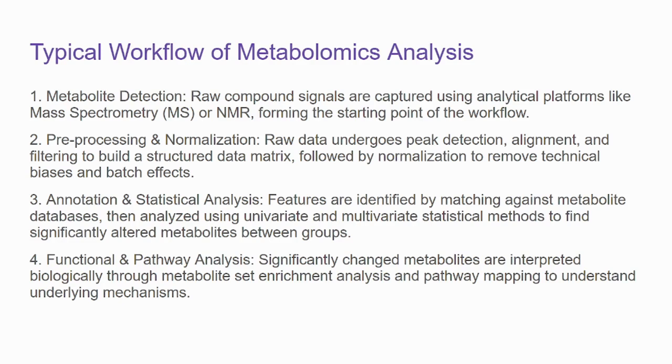That is the raw file or the input file, just like we use FastQC for shotgun analysis, that is the input format. In metabolomics, the file is MZML. From that, we proceed with the downstream analysis.